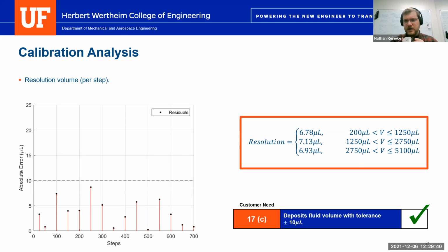But like you were saying, I don't think, because we're doing the large volumes, that would be an issue. But if we could make this one also do the medium volumes, which is a limit of 100 microliters to 500 microliters, then backlash would be a problem, especially 10 years down the line or 15, or if they're going outside of the life range of our particular unit. That could lead to an issue for those small volumes. But for the 500 to 5,000, I don't think it'd be a problem.